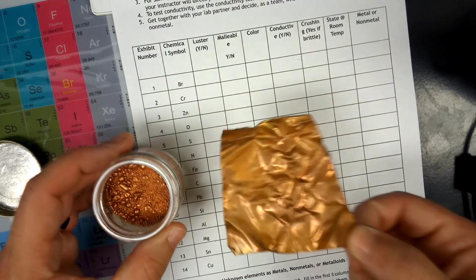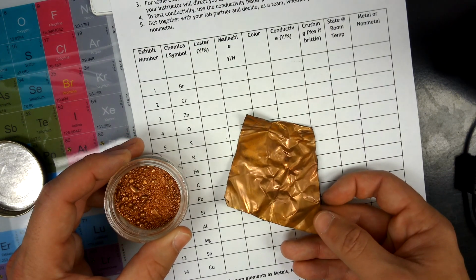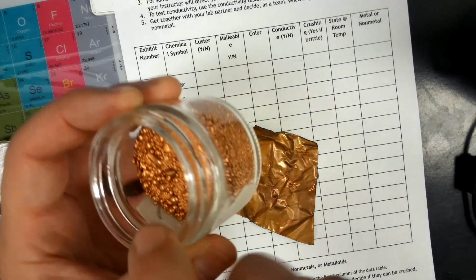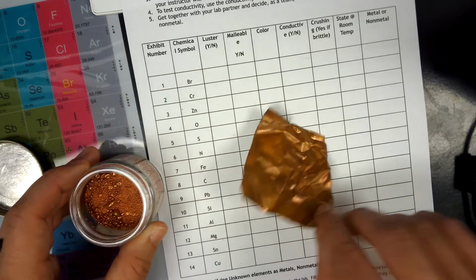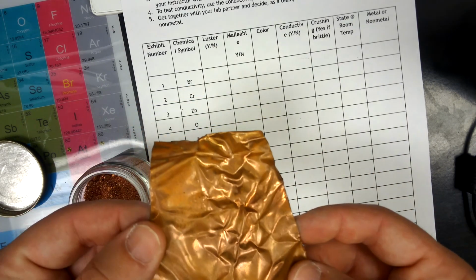In its different forms, you can sometimes pick up on some of its qualities a little bit better. This is what Mendeleev had to do too. Even if something didn't quite make sense, like with my little pieces of copper here, it's somewhat difficult to see that they're shiny, although copper is pretty easy. There's other ones that are tougher. But once you get to the sheet here, you can actually see the light play off it. You can see that it is super lustrous.